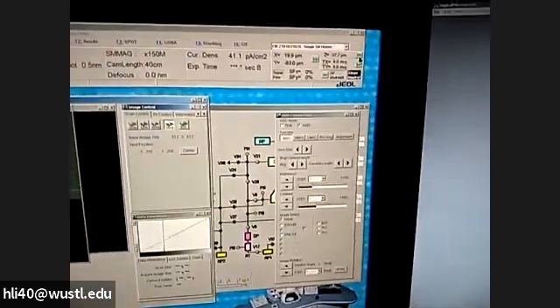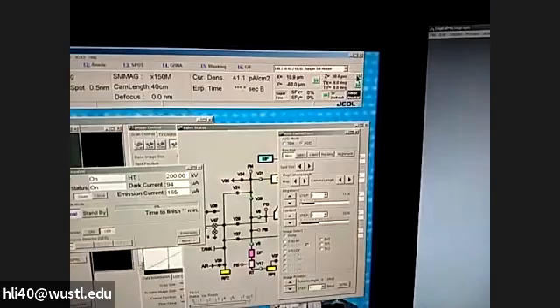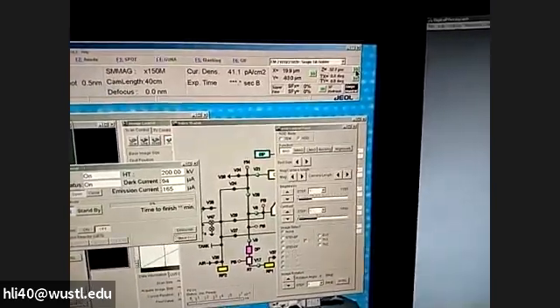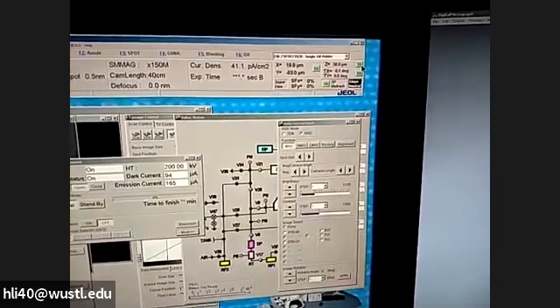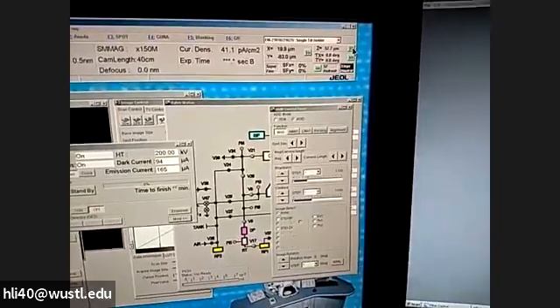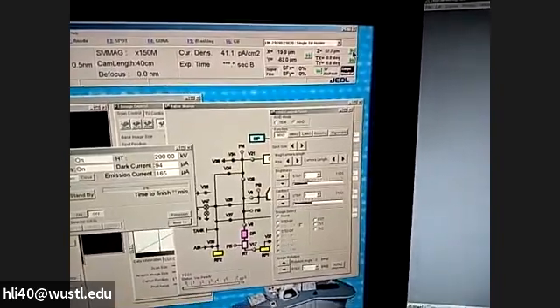What you will see may be just too bright to see anything. You need to adjust the Z gently. Make sure the coarse button here is up, and adjust the Z button up and down. Pay attention to the Z speed — set it to medium speed. The three triangles means fast, two means medium, and one is slow. We go to medium. Now adjust the Z button — two fingers, one up and one down.